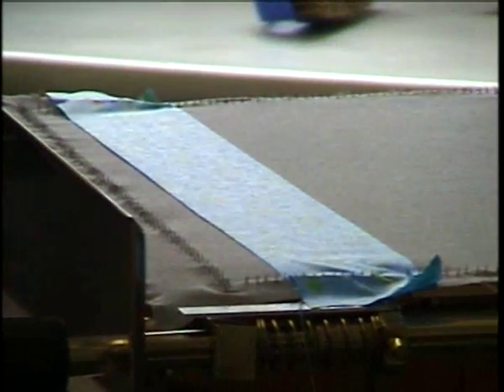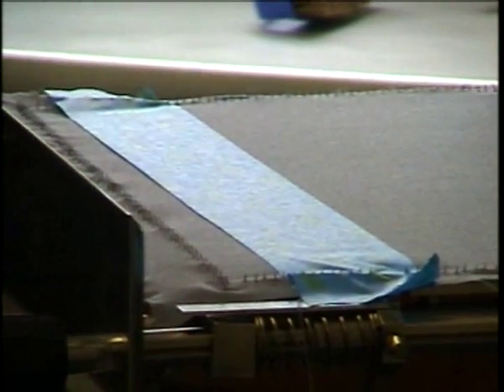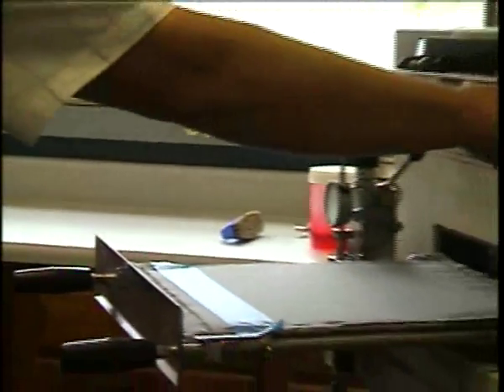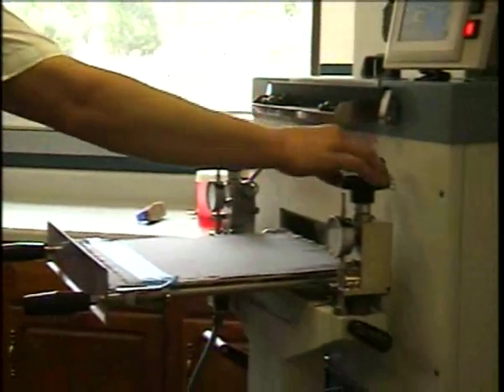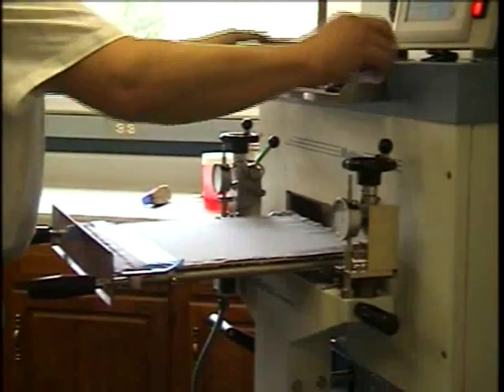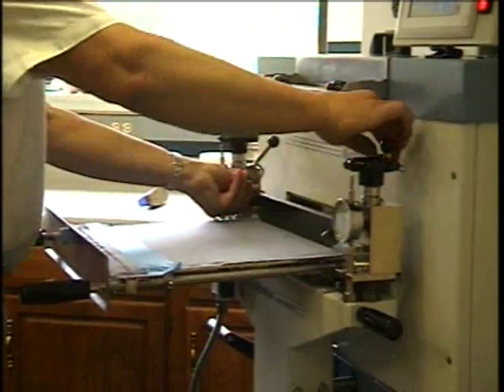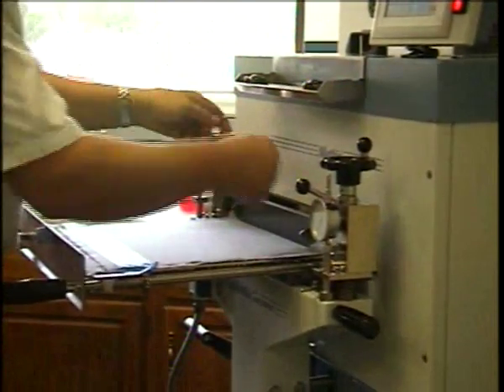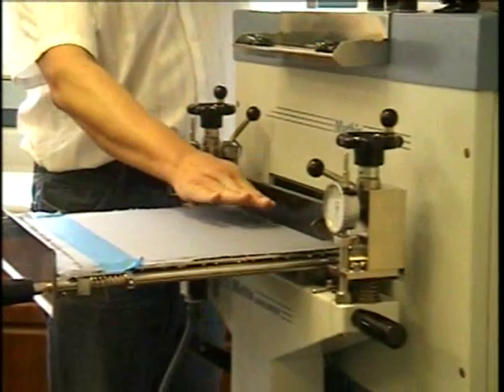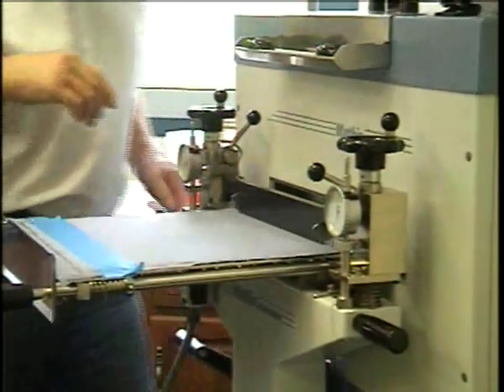So we're going to be coating some edible film solution today, and we're going to make a fairly small coating. Since I don't know what the thickness is of my substrate, I'm going to insert the knife, and I'm putting it into a 90-degree angle, so the substrate and the cloth form a 90-degree angle.